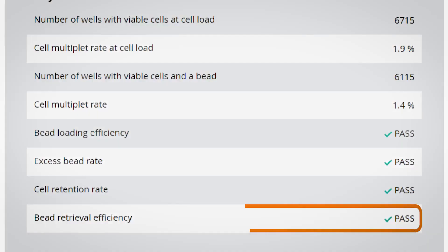The scanner will report a passed message if more than 90% of beads are recovered. Proceeding with our experiment, we can see that the bead retrieval step worked, and our overall experiment was successful.